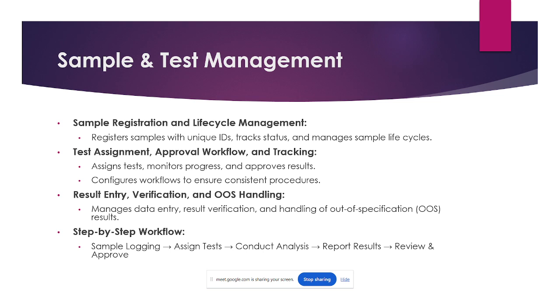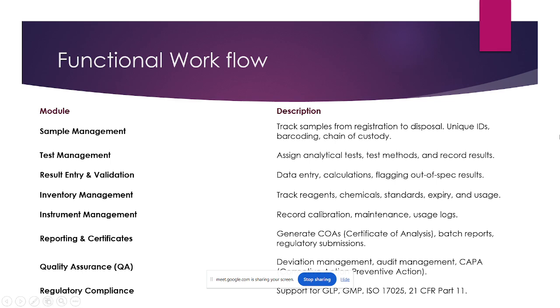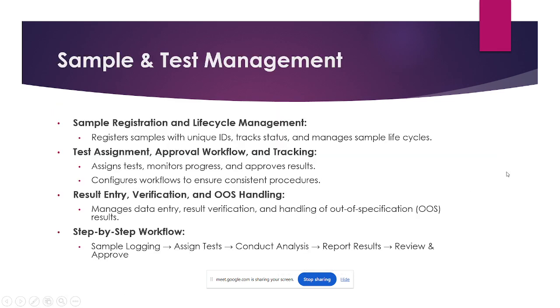And then coming to the sample and test management, this is like end user support. Once you have created the sample, unique IDs will be created, and then we can do the sample result entry. Okay, and then tests will also be assigned automatically to the sample. Otherwise you can assign the test to this particular sample, and then you can do the result entry. You can monitor the results and all. Okay, once the result entry is done, we need to do the review verification.